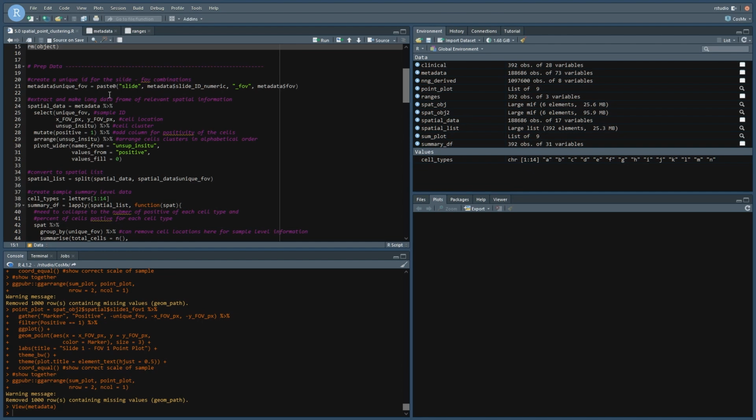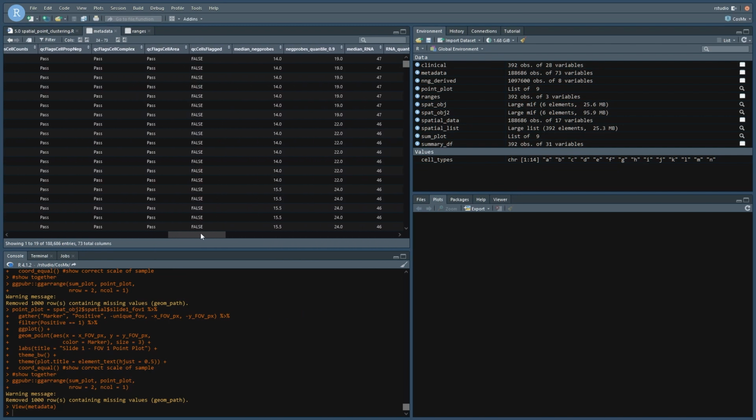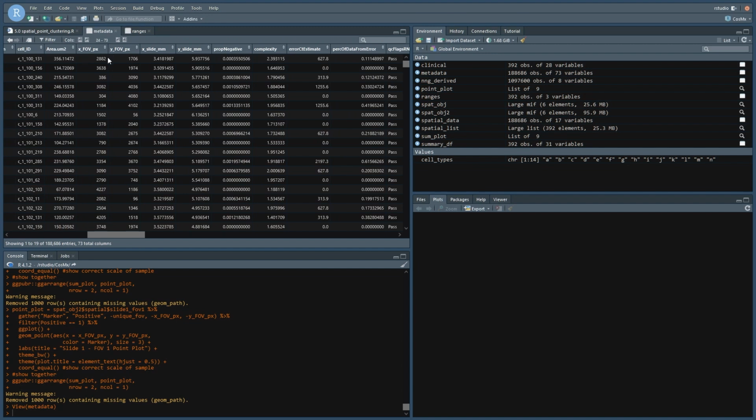There's code in here too if you want to download it. And what this package does is it allows you to look at clustering of point patterns of biological data. So we have points, our X and Y locations of our cells, and if we pass that into the spatstat package, we can look at the clustering of, say, this cell with this cell, for example, and get a metric for that at different radii.